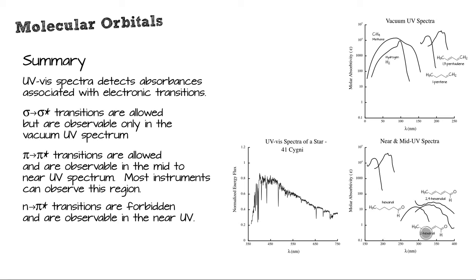Did your transition happen? Did the conjugation change? You were doing a hydrogenation. The conjugation should have changed. The functional group should have changed. So these spectroscopic methods are useful. We tend not to put a lot of emphasis on them for structural elucidation, but you'll find them very useful for following the progress of a reaction. If you know the absorptivity of the molecule that you're interested in here, you will, of course, be able to calculate its concentration using UV-vis spectroscopy. Very useful for that. Very useful for following reactions and doing kinetics.